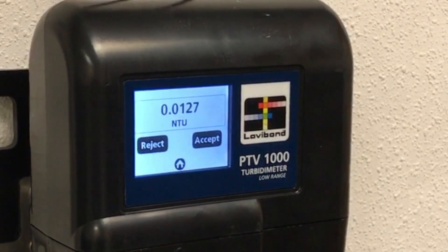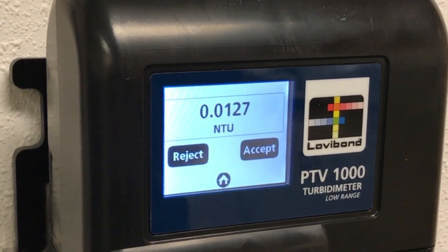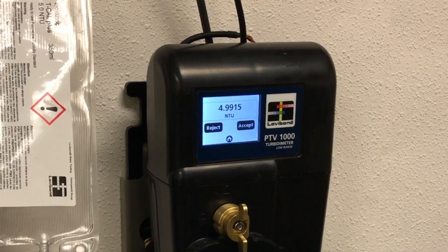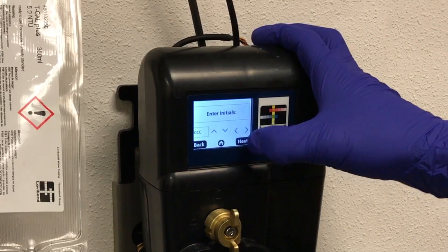Hitting Next on the PTV's touch screen will preview the current NTU value. It will refresh as the standard works its way past the sensor. Wait a few moments for the outputs to stabilize.